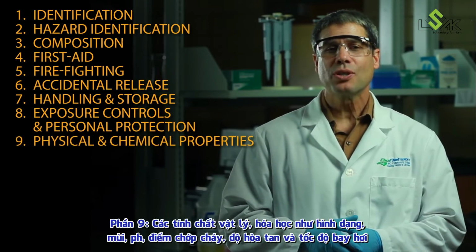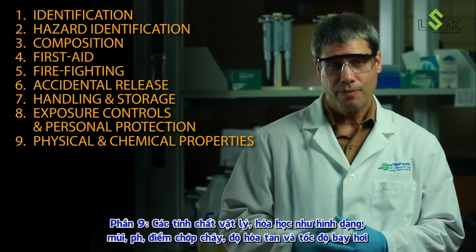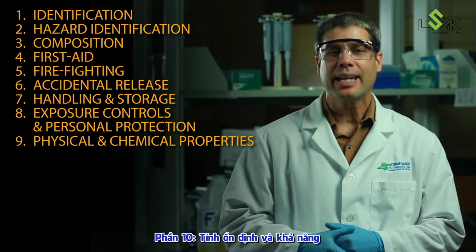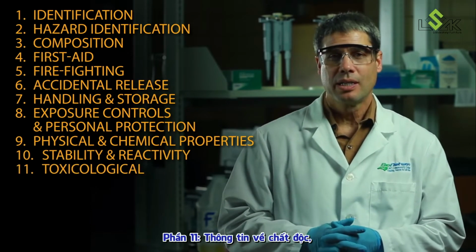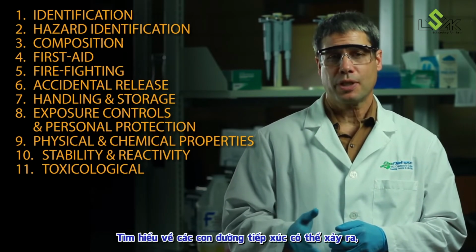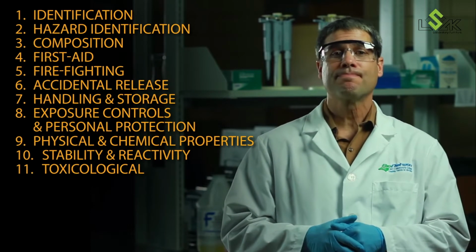Section 9, Physical and chemical properties, such as appearance, odor, pH, flash point, solubility, and evaporation rate. Section 10, Stability and reactivity, how to avoid hazardous reactions. Section 11, Toxicological information, find out about the likely routes of exposure, symptoms, as well as short and long-term effects.